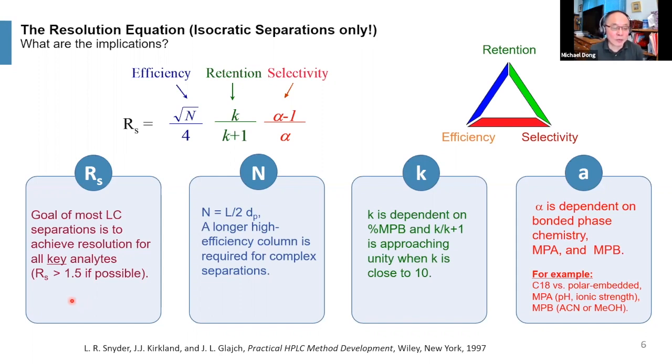So once again, the goal of the separation in those cases is to quantitate your drugs only, right? You don't care about the extraneous component. You don't care about the caffeine if the patient had a cup of coffee. If you use UV, you see a big caffeine peak, but you don't care about caffeine. We only care about the drug that the patient has taken, maybe after dosing.